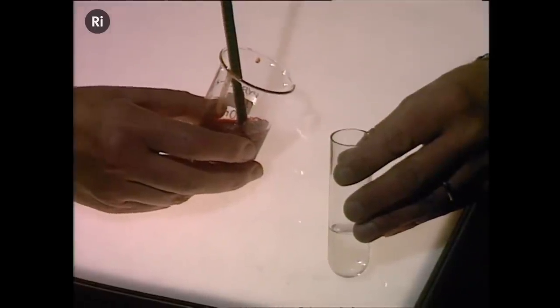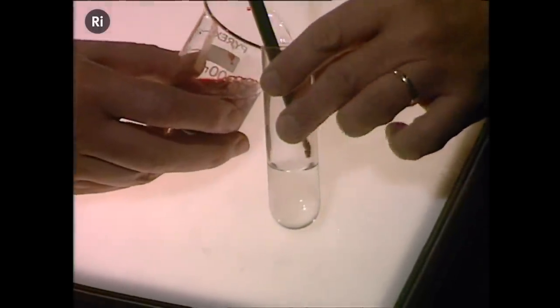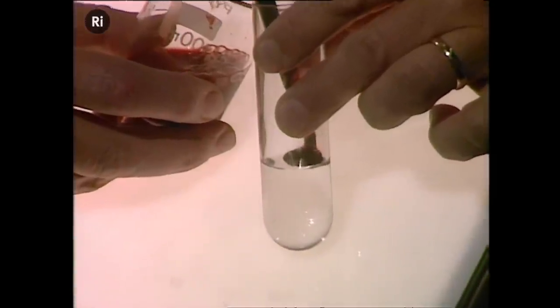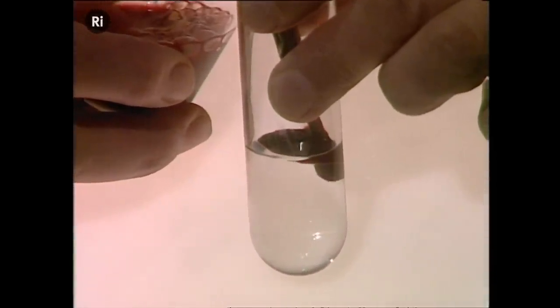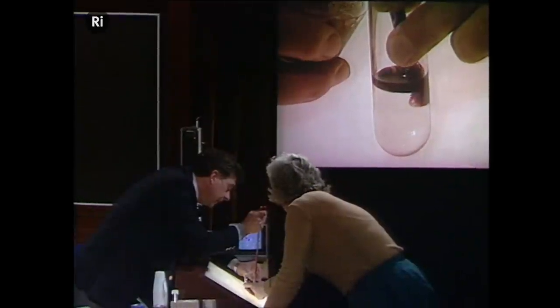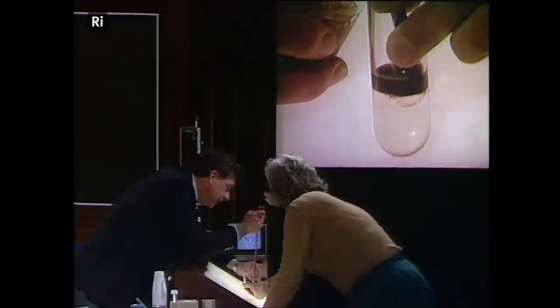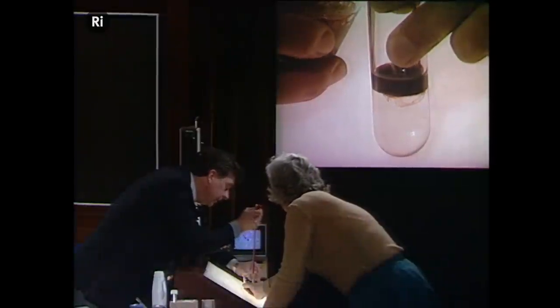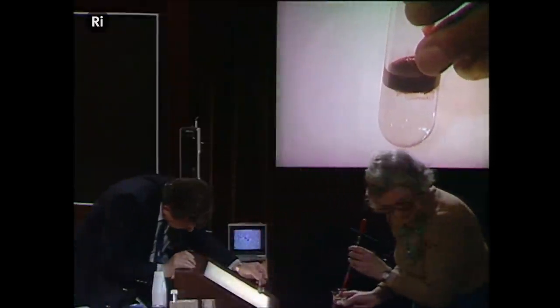So I'm going to layer this slowly onto the solution, and you'll see what happens, that if I do it carefully and slowly, it'll just sit there on top, because the density is such that that's where it sits to start with. Thank you very much. So you see it sitting there?